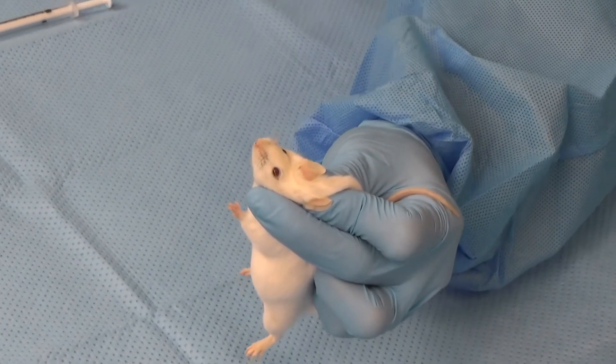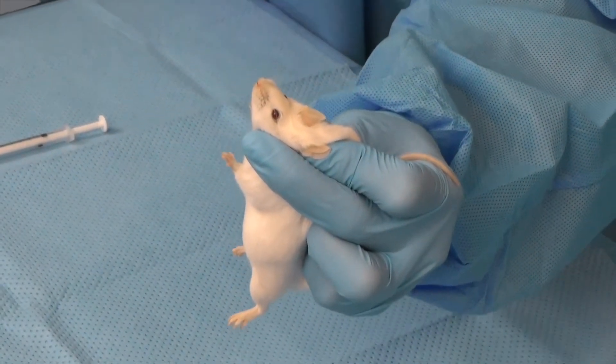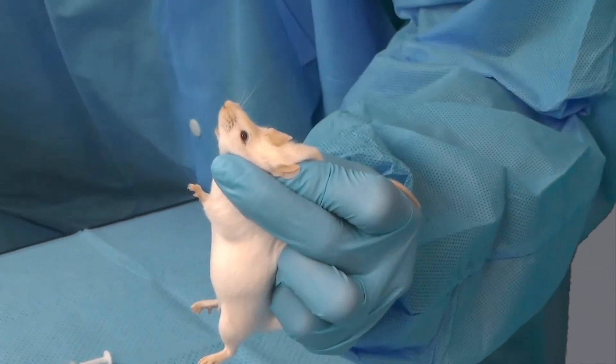The mouse should appear as comfortable and relaxed as possible, as measured by respiratory rate and effort that are within normal limits.